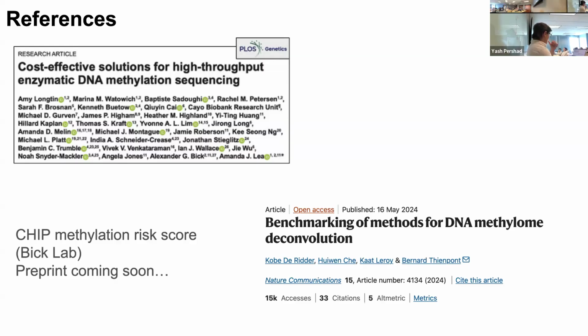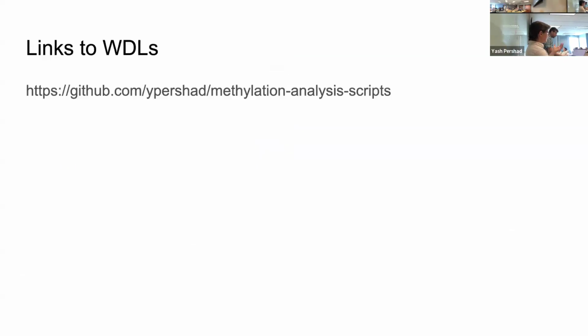Yep. Cool. We do have a CX file that we can share. Yash has put together some analysis scripts, and I've put together some very basic scripts to go from the CX file to the methylation matrices. So we can share that with you. But also, if you've gotten all the information you wanted, this is a great time to wrap up. Whatever you all want.